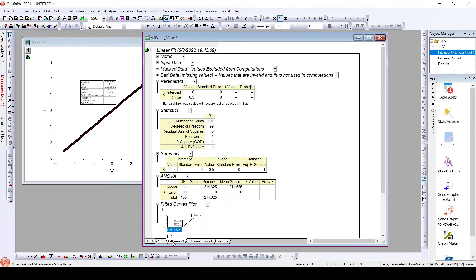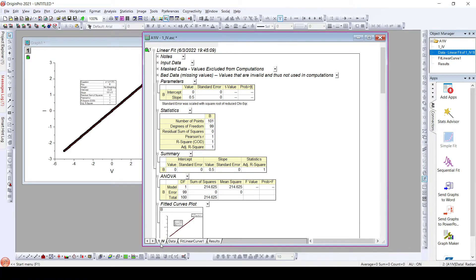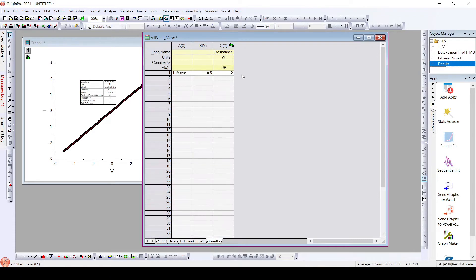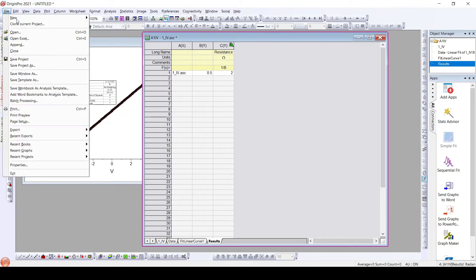I will rename this file as 'data'. This is the identifier that we are using and this is the result that we have. Now what we will do is save this particular workbook as an analysis template.